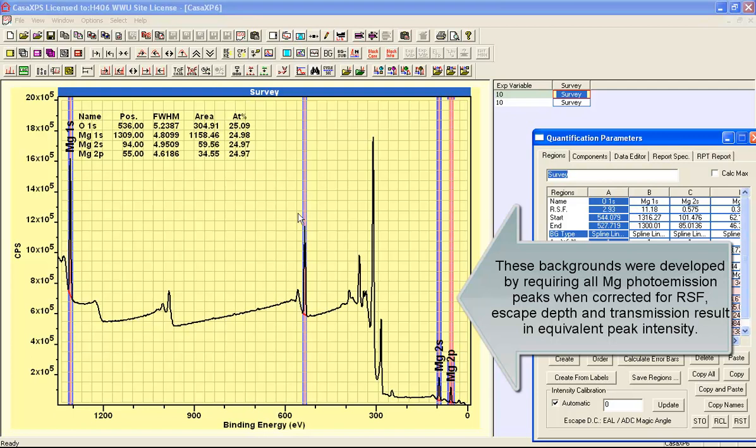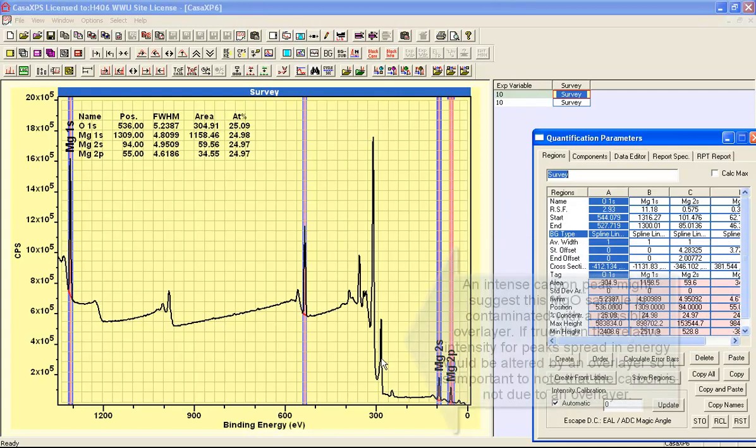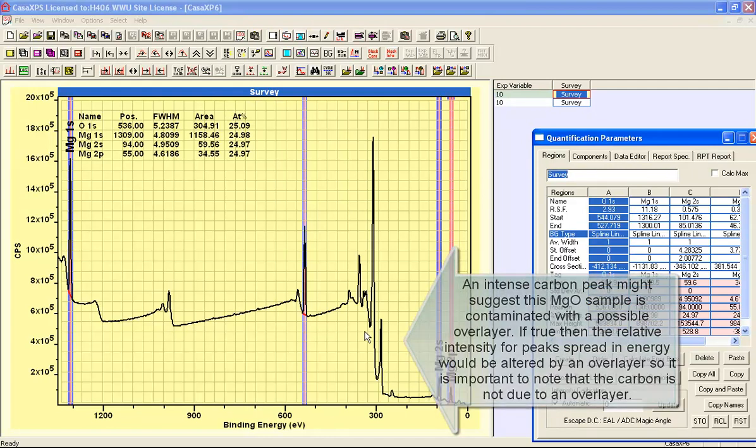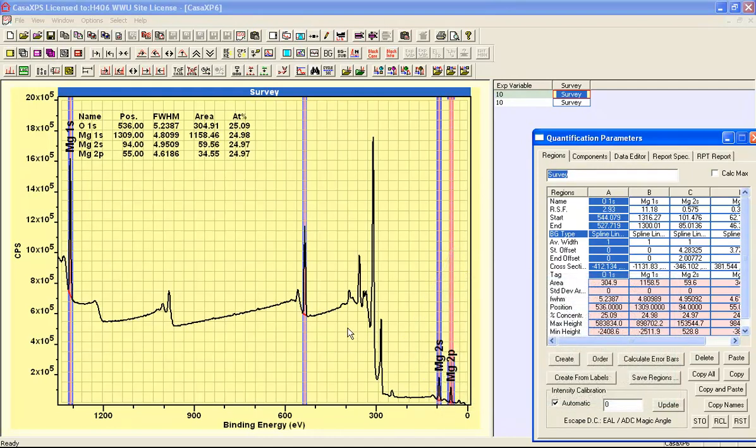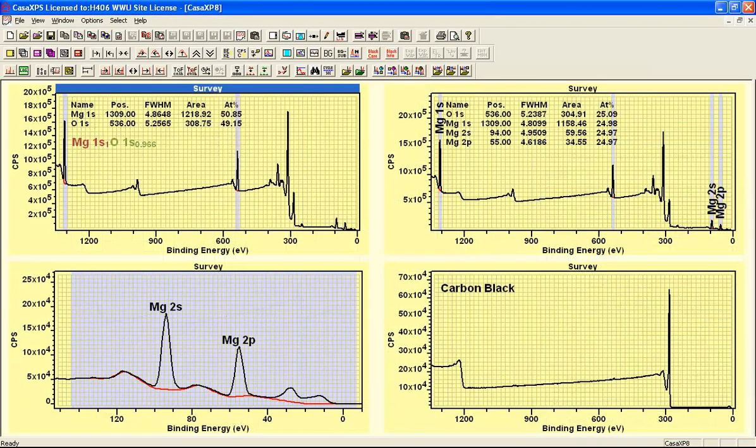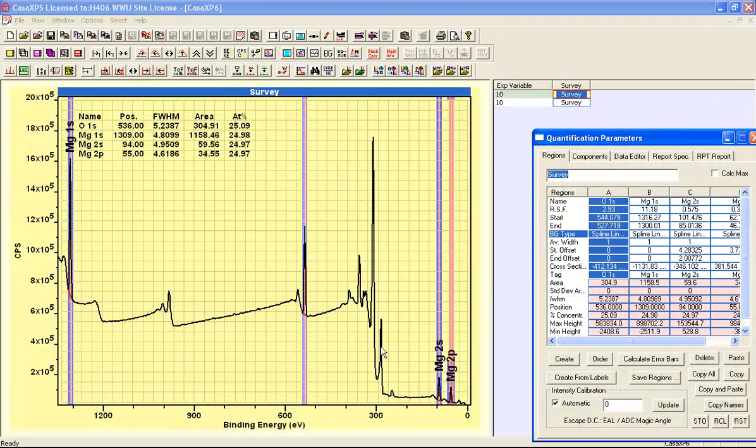Now there's one other point that I should make here is that there is a carbon 1s peak, and you might think that this could imply a surface contamination of some description on the magnesium oxide. However, the magnesium oxide was mixed with carbon black as a conducting material that has only carbon, very small oxygen peak.